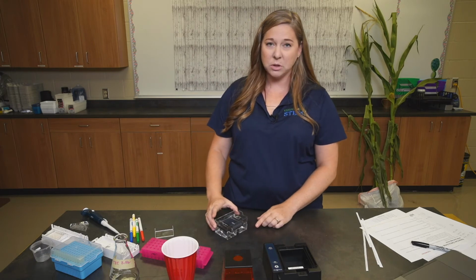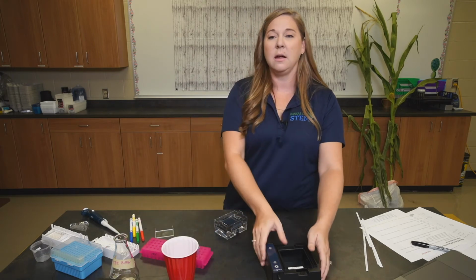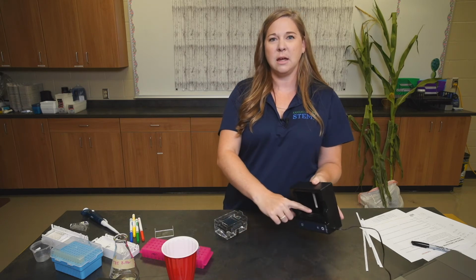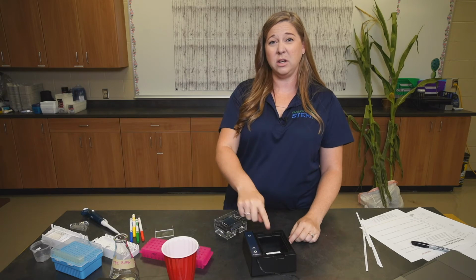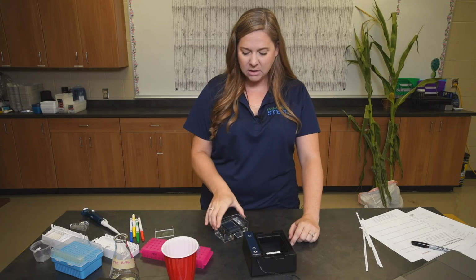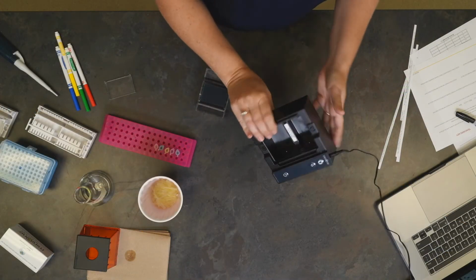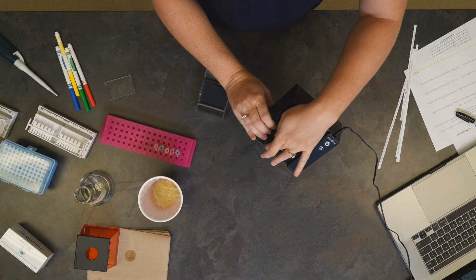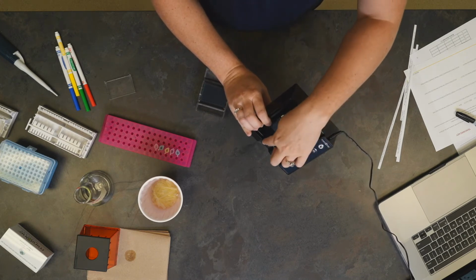Remember these little electrodes that I showed you before? These electrodes here match up with some gold rivets that are actually in the carriage. That tank will only go in here one way. Making sure that I have my wells pointing towards the negative part of the carriage and not the positive. It is marked on the carriage right here, negative and positive.